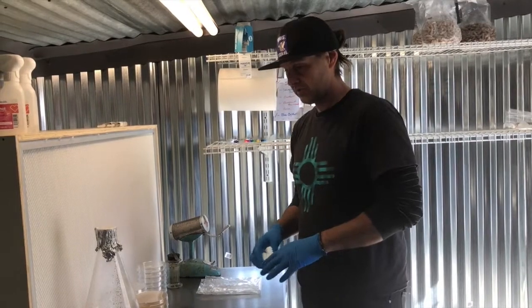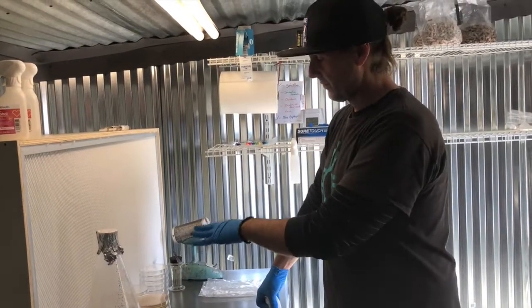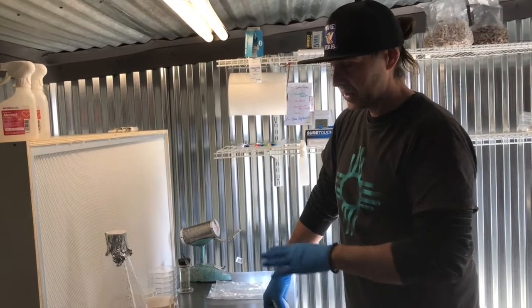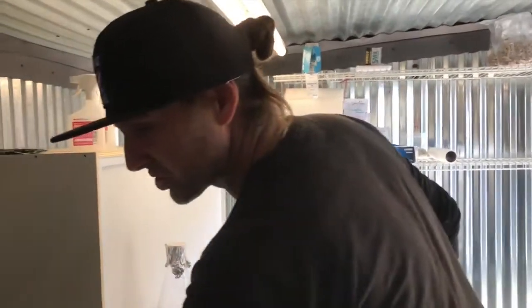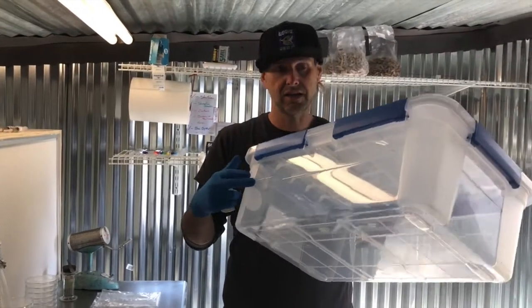We've got one more flask of agar to pour and then we'll be set. We'll let these cool down completely, and once they're cooled we store them at room temperature in a tub like this.